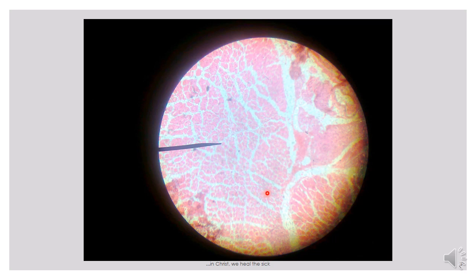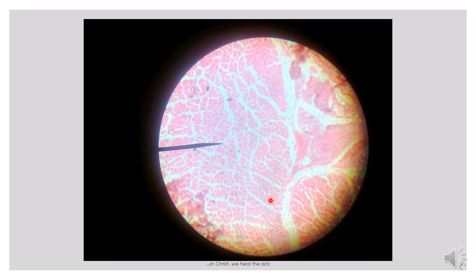We can also trace out the epimysium that separates one whole muscle mass from another. So we can recall that the tissue separating individual muscle fibers is called endomysium, the one bounding and separating fascicles is called the perimysium, while the one separating the whole muscle mass is called the epimysium.